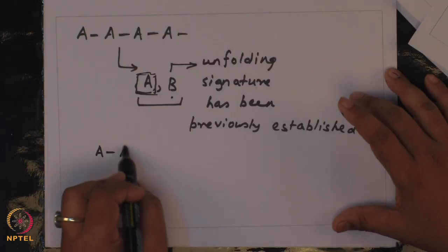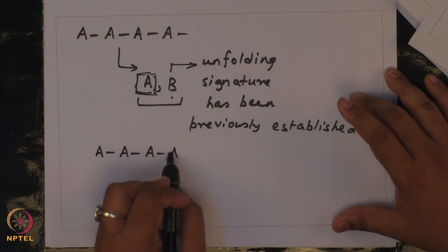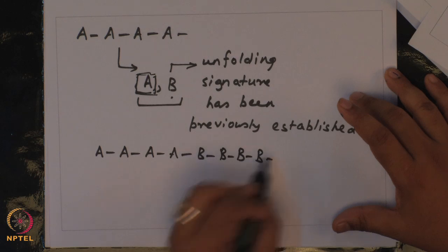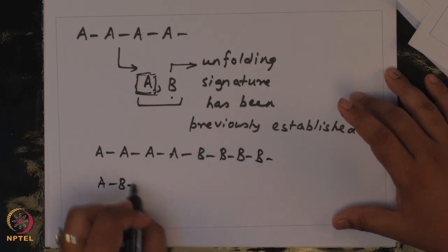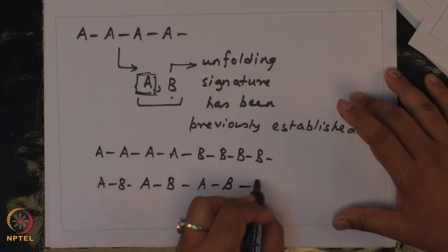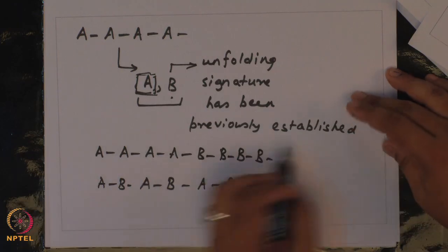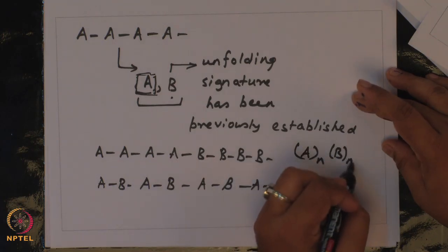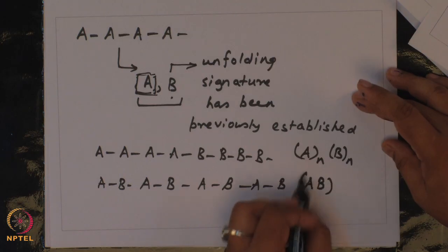Now, the next question is how do we design our multi-protein? Should we have a design like A followed by B, or AB, AB? In short, do I repeat A n times, B n times, or AB n times?